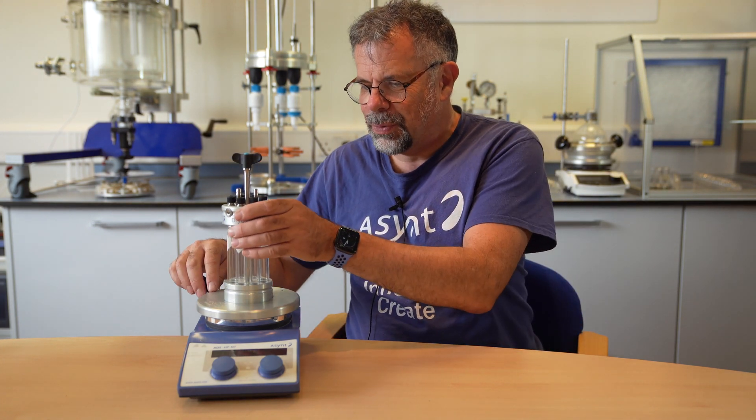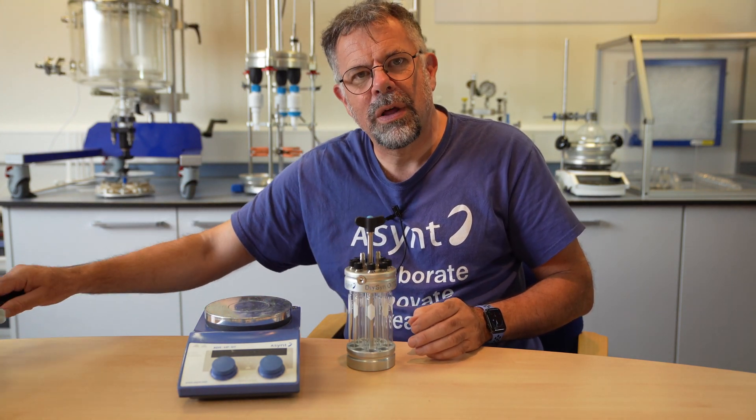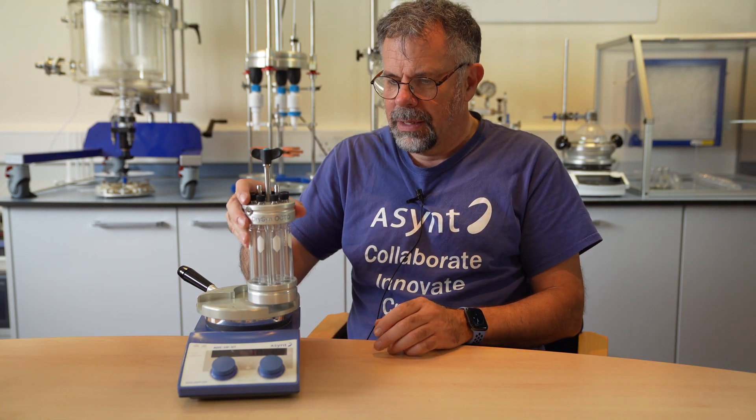Just like the original Octo, the Octo Mark II can be used for not just eight reactions at a time on a hot plate, but many more. You simply swap out the single-position base for one of our Drysyn Multi bases. Eight, sixteen, twenty-four reactions — all on one hot plate stirrer.